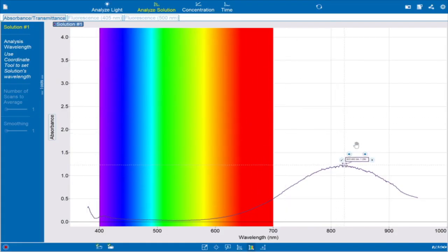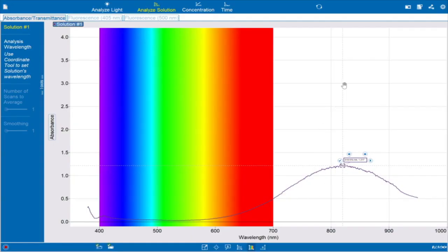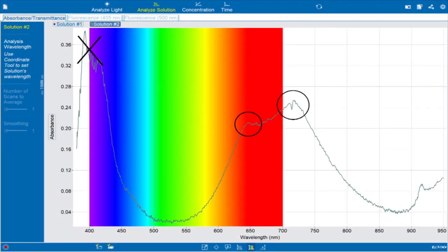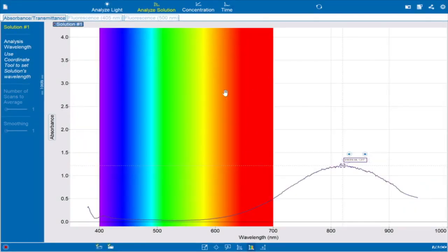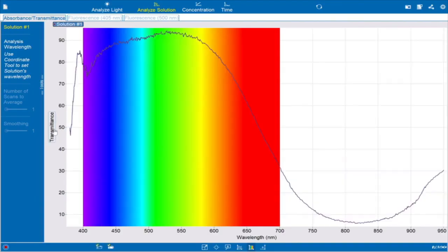Now that you have the spectrum for your first solution, record the lambda max in the data table for question 1 on the report form. You should also calculate the epsilon value for each substance — two values for your nickel solution — and check your answers with your lab partner. When you analyze your nickel solution, there will be multiple peaks on your graph. Make sure to select the two peaks in the infrared region, not the peak in the ultraviolet region. You can click on the word Absorbance on the y-axis to switch the graph to transmittance. Discuss which wavelengths are absorbed and transmitted by each solution, and what colors the solutions appear. After this, answer question 2 on your lab report.